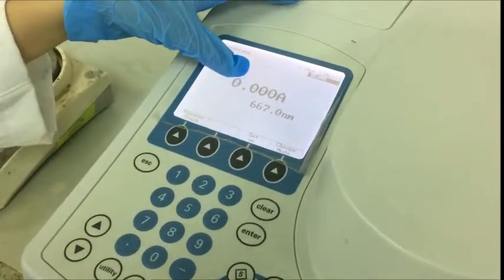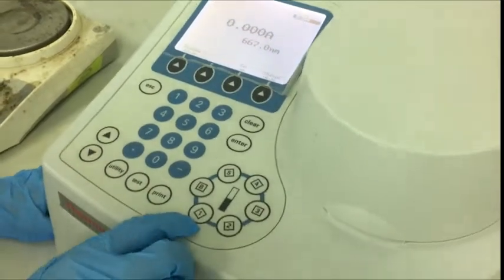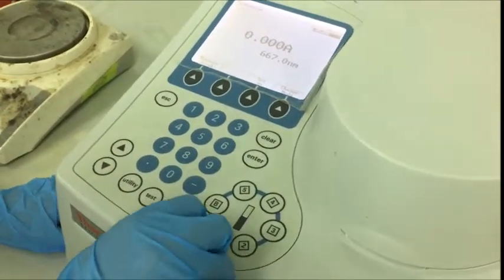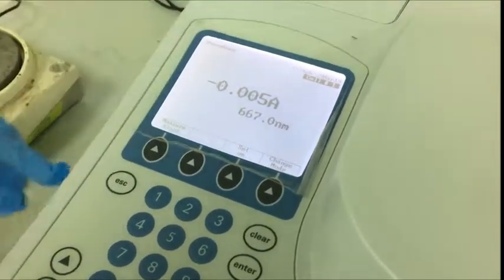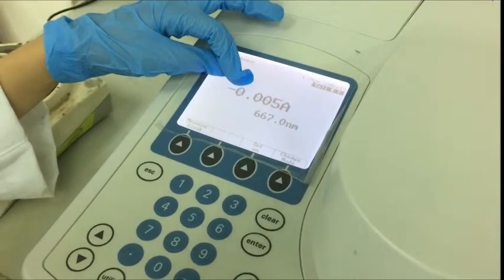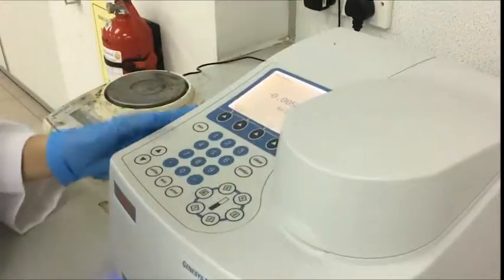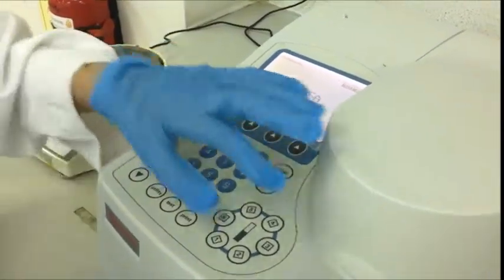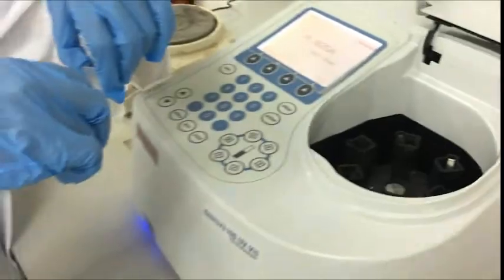Make sure it is at 0 absorbance. Now I will select the one where my sample is, until it changes into cell 1. It shows automatically negative 0.005 absorbance. After I finish my result, I will take out my sample and the blank and I will wash them for further use by the next user.